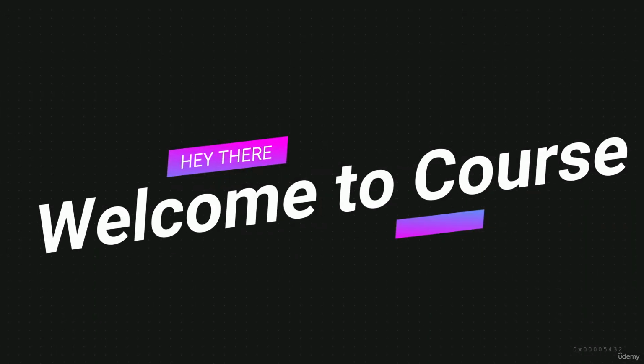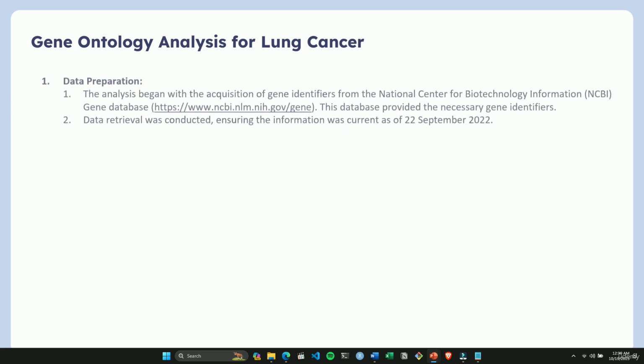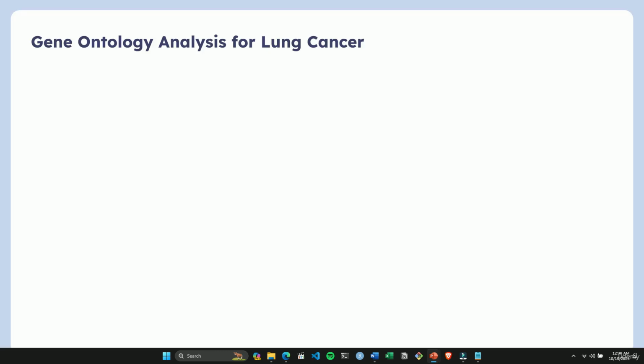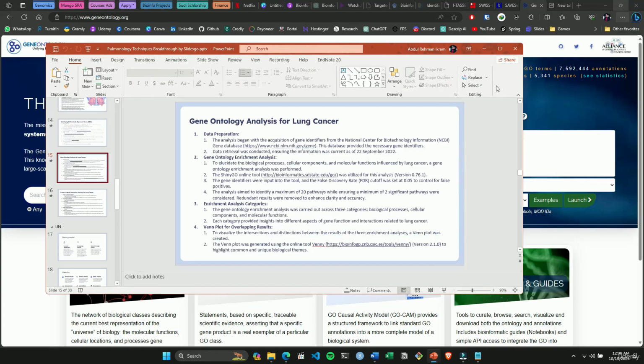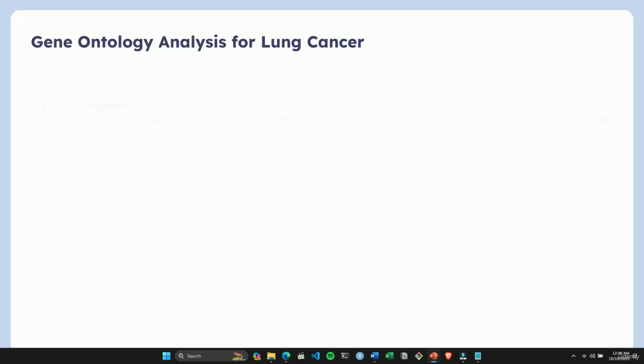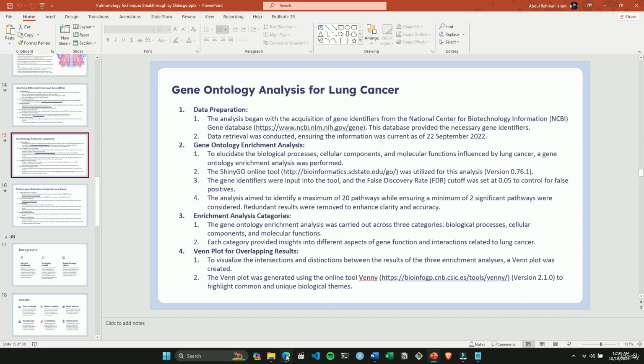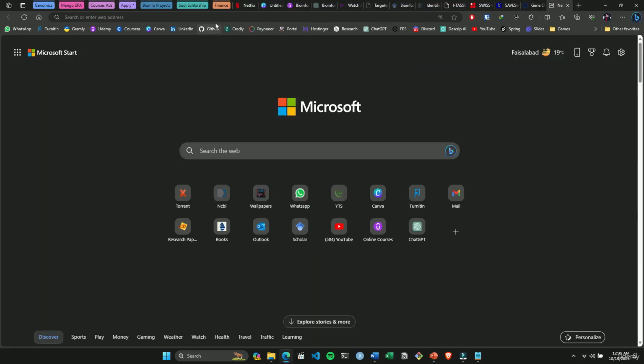So now let's talk about gene ontology. Gene ontology, or enrichment, is the functional annotation of your genes, what kind of functions they perform. As we say, we have three kinds of gene ontological function.